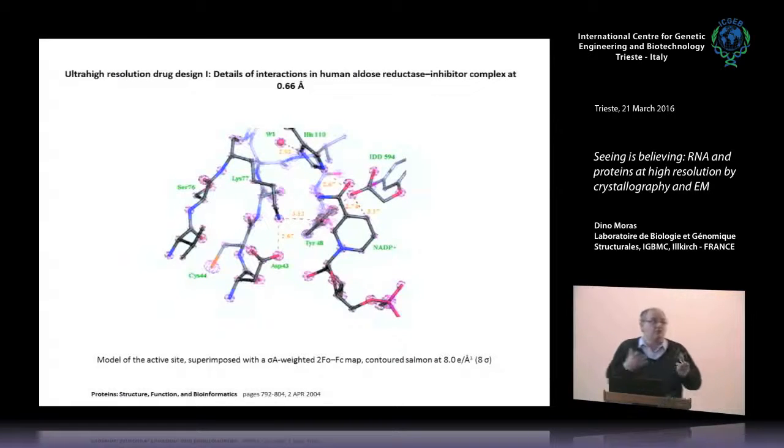This number shows the resolution, which means the limit of diffraction. In turn, it shows how much diffraction data you have, and then the structure is here. Of course, when you lower here, it's called an electron density map, contoured at 8 sigma level, 8 electrons. So we clean out everything below the 8 electron range.